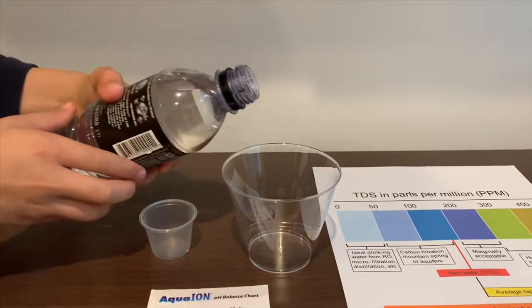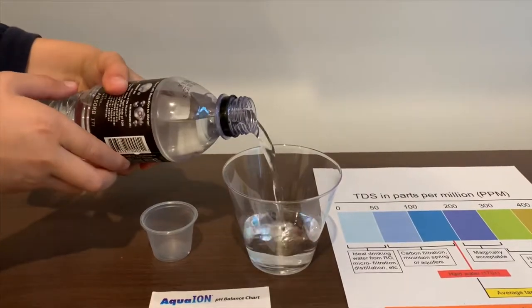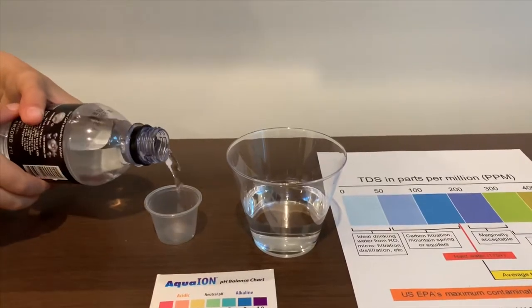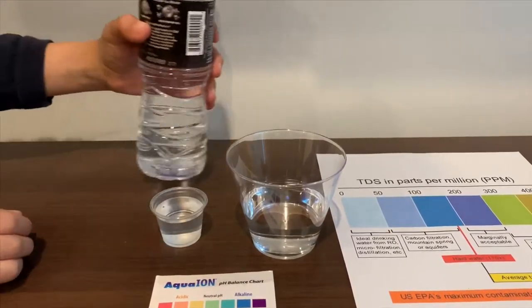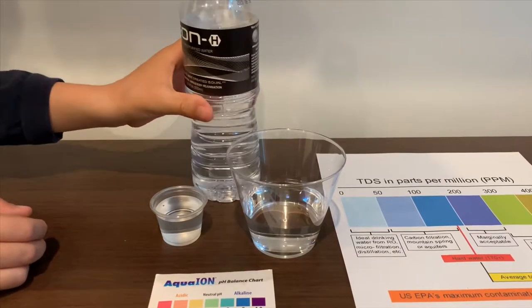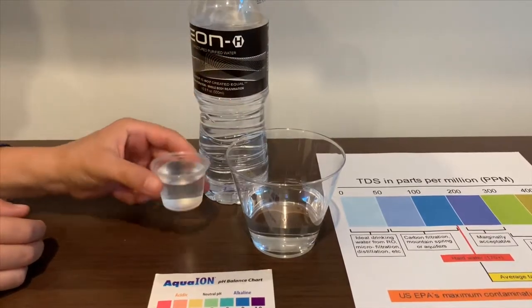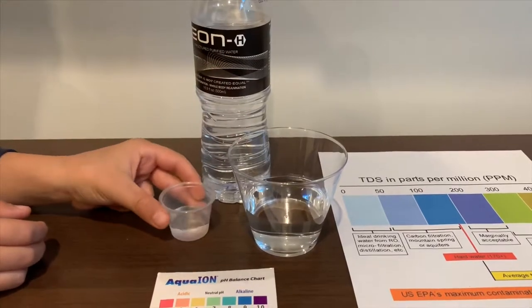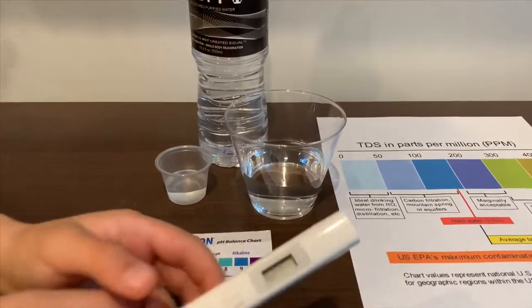Let's pour some water in. This is a little too much for the pH cup. Let's pour some back in the TDS. First we're going to test the TDS level.